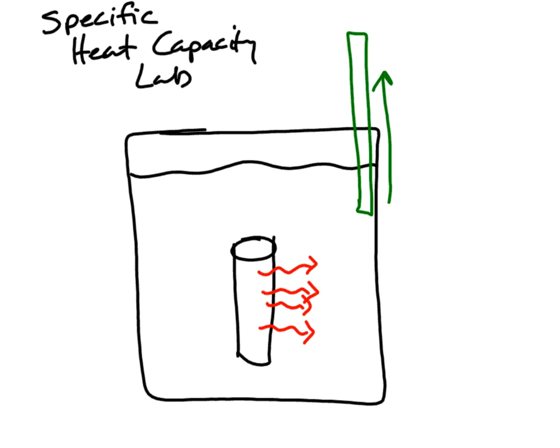Well, it will reach what we call a thermal equilibrium, where the temperature of the water and the temperature of the cylinder will be the same. What you'll look for on the thermometer is when the temperature is going to go up, up, up, and all of a sudden it stops and just slows down, or it's pretty much at the same temperature for, say, 5 minutes or longer. Then that is your thermal equilibrium, and that would be your final temperature.